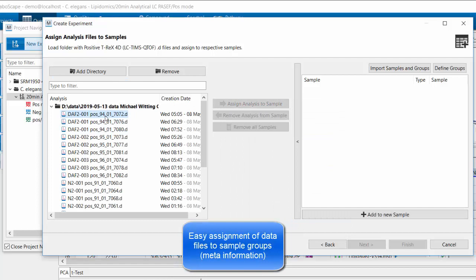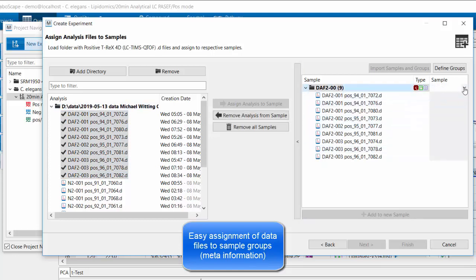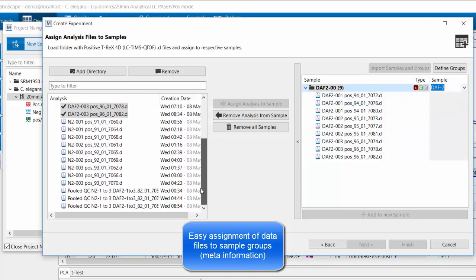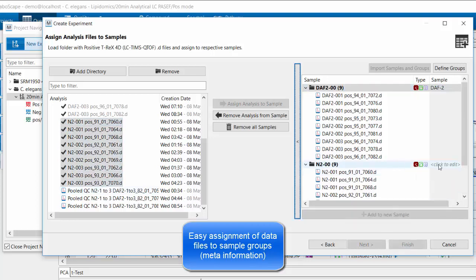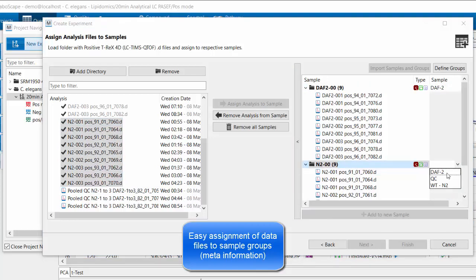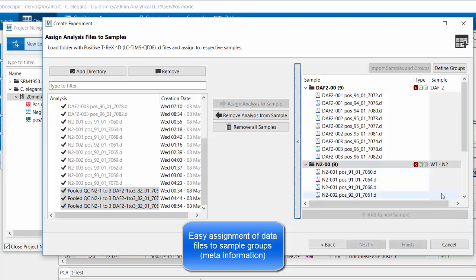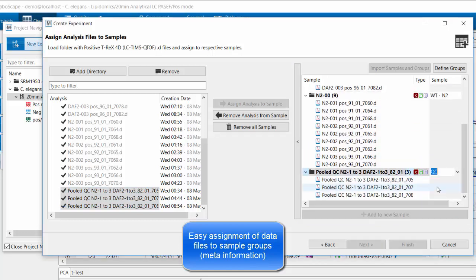Now I select the data from three technical and three biological replicates of a mutant called DAF2 from these C. elegans worms, and I define this as a group. Next, I select the wild-type samples, which are also called N2 in this case. And last, I add the pooled quality control samples that we also analyzed.